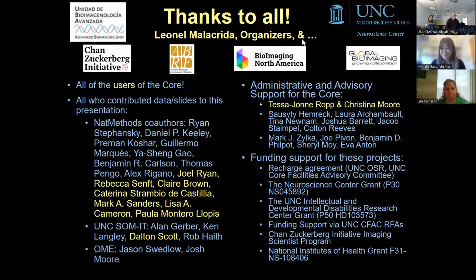But just after we finish the seminar, I will start to install the MicCheck in all the microscopes we have around, and it's just a website. You can start to play around with the checklist. It's very nice. And it's just an Excel sheet that you can edit and upload to make those checklists custom to your own core. So we're hoping that saves people a lot of time and accuracy.